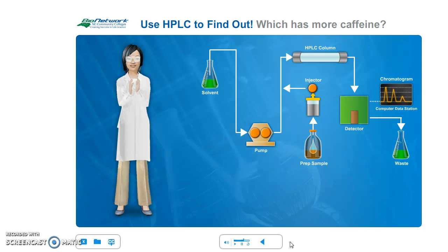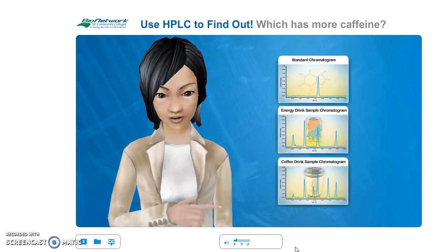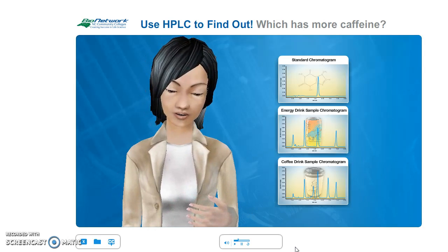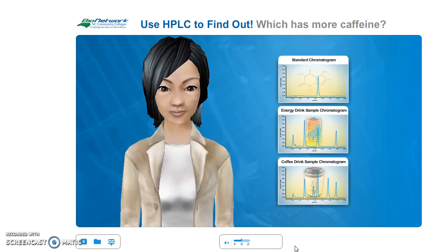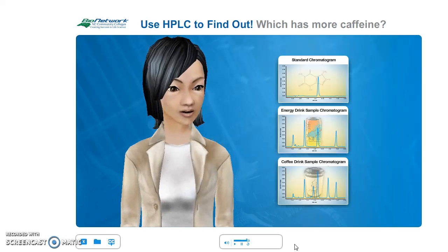Remember, a chromatogram is a representation of the separation that has been achieved using the HPLC system. Click the next arrow and we'll look at the results. Here are the results. Take a moment to look at each chromatogram. What do you notice about the differences in the three chromatograms? Now, before we analyze the results, I want to give you a chance to look at the chromatograms in detail. Starting with the standard, click on each chromatogram to see it up close.